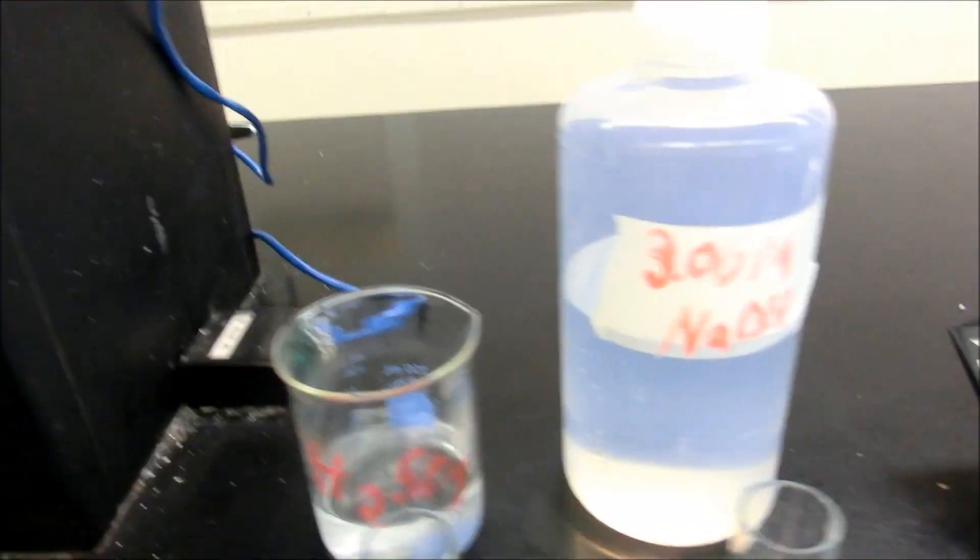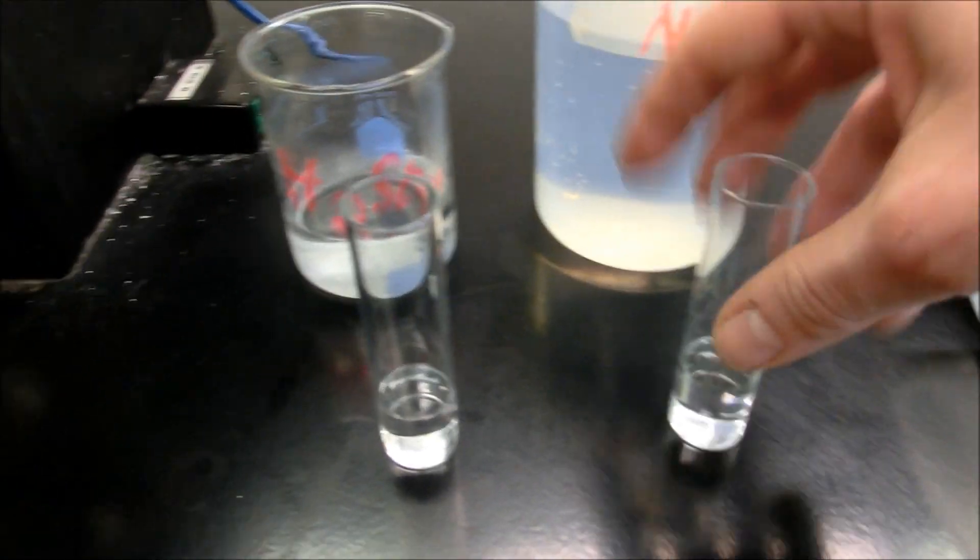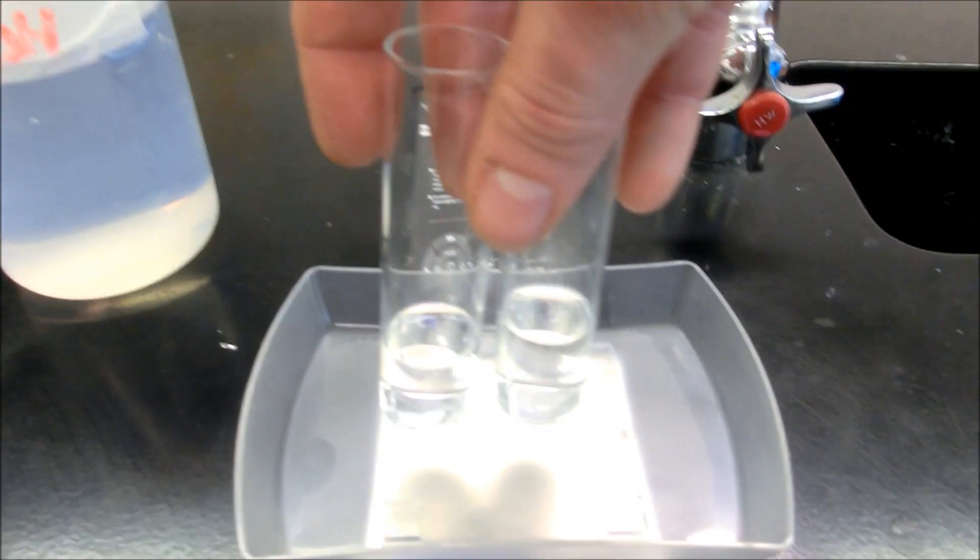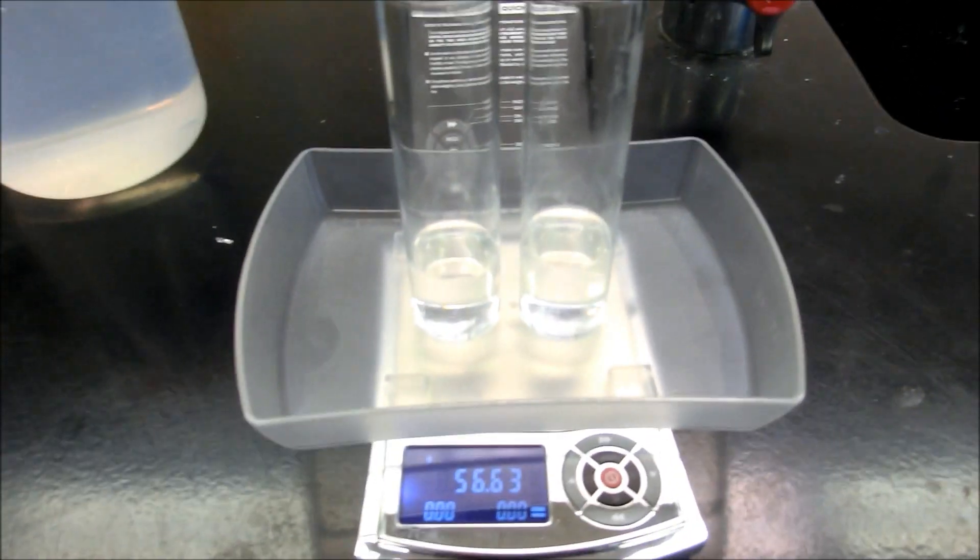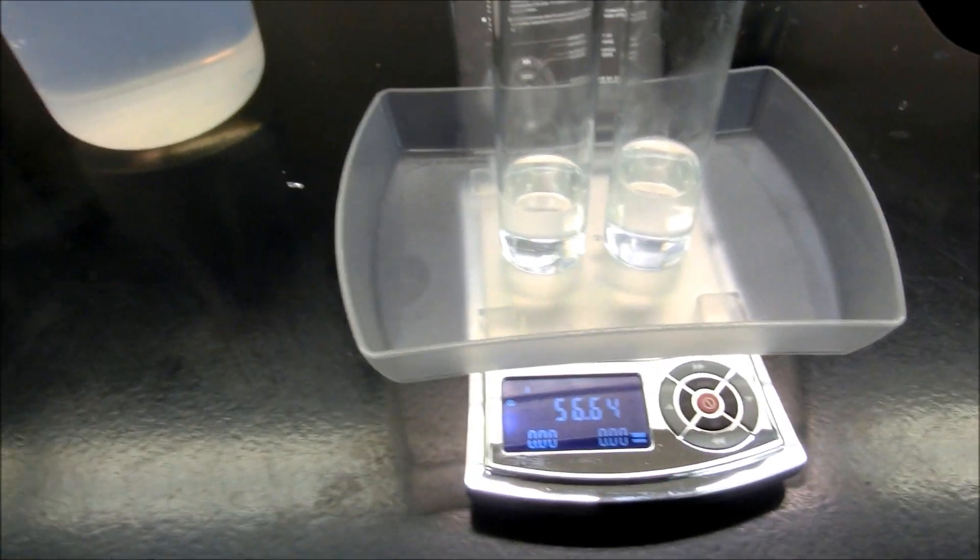We've got sulfuric acid and sodium hydroxide. I've poured a few of those things already into those two containers. And if we check out the mass of those, you'll notice that the mass ends up being 56.64 grams.